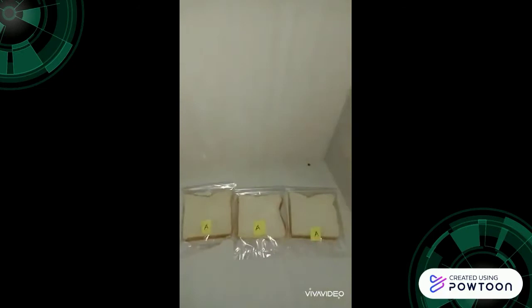Now we put our samples that are not exposed to moisture in the fridge. Now we put our sample in the refrigerator. And this sample we put under the refrigerator. Now we put our samples in the wardrobe.